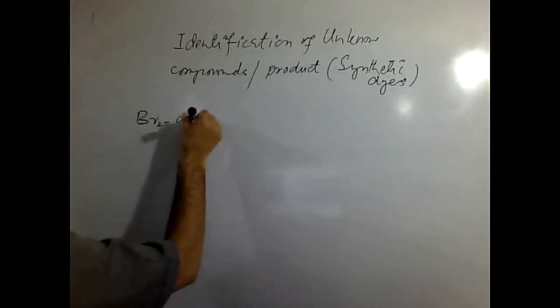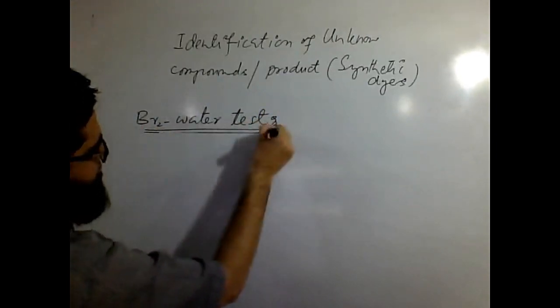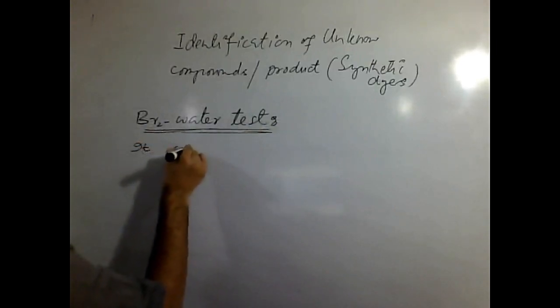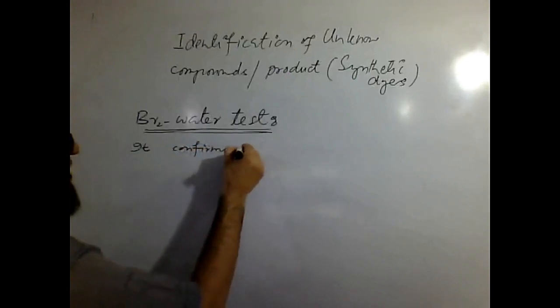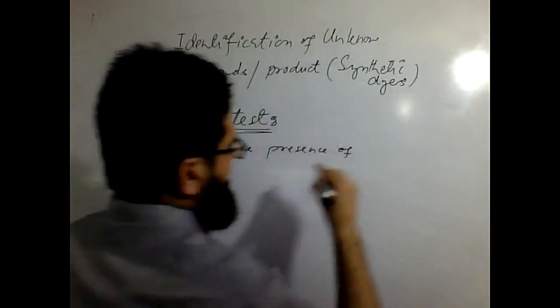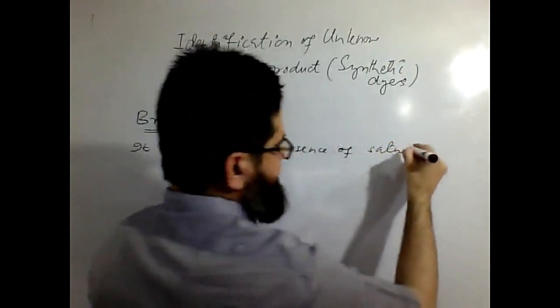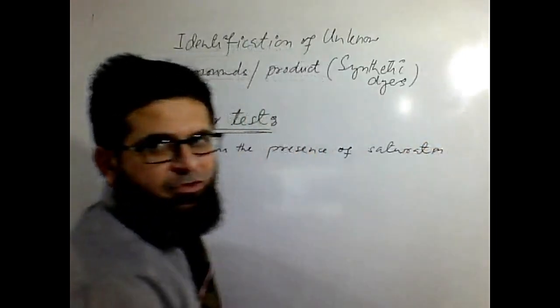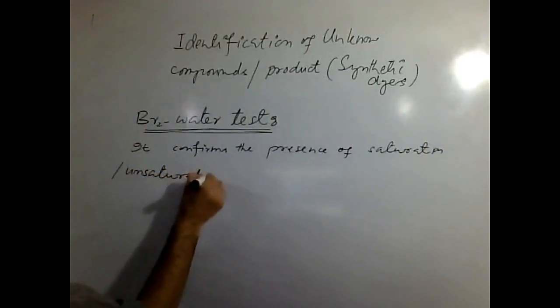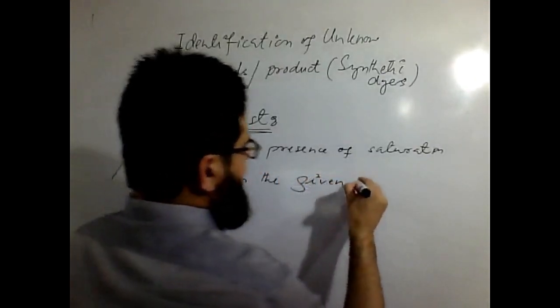Bromine water test. It confirms the presence of saturation or unsaturation in the given compound.